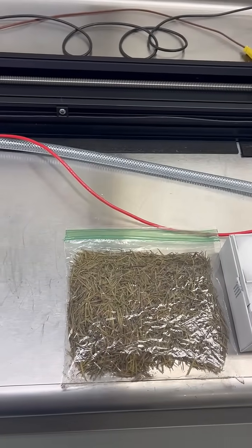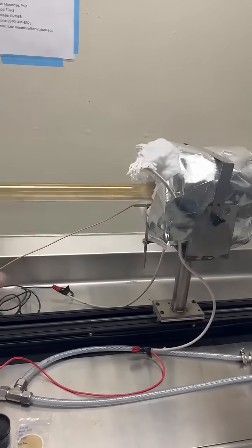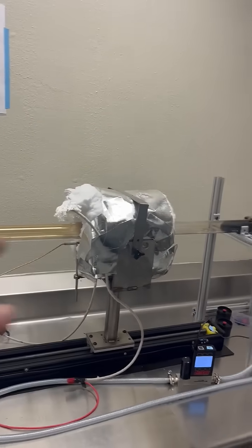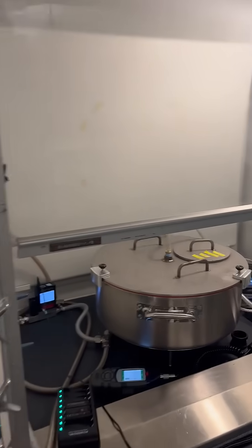This is the material that we're burning today, Douglas fir needle, and the smoke that's produced inside this tube goes down and is collected here, brought through this delivery tube into the hood.